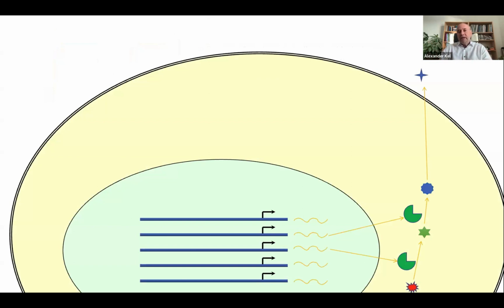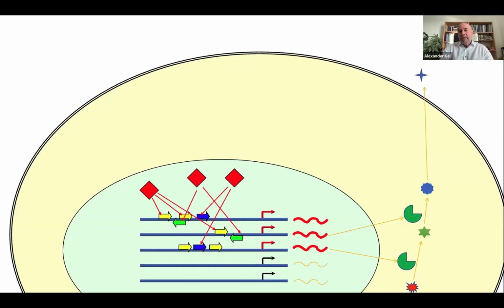What it means is that when we measure, for instance, the expression of genes, like we will see also later today, and we also analyze ATAC-seq data, the open chromatin where transcription factors can bind, then the question is how these events are controlled, or what happens upstream.